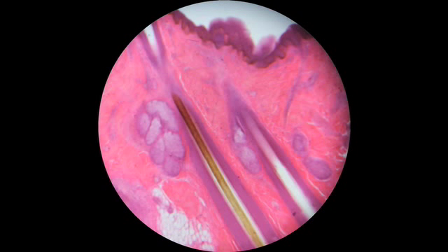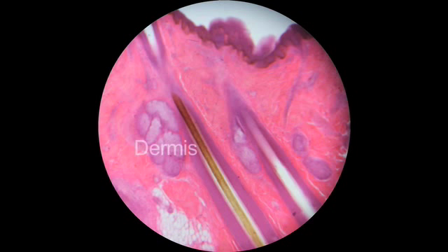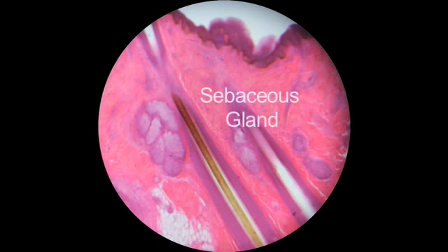This is the image that we see. It contains a number of different kinds of cells in different layers. The first layer, the outermost layer, is called the epidermis, and it consists mainly of dead cells that protect the outside of our skin. The bulk of what we see in this particular view is the dermis, the pink stained tissue, which lies directly underneath the epidermis. In some sections, you also see the sebaceous gland, marked here with an X.